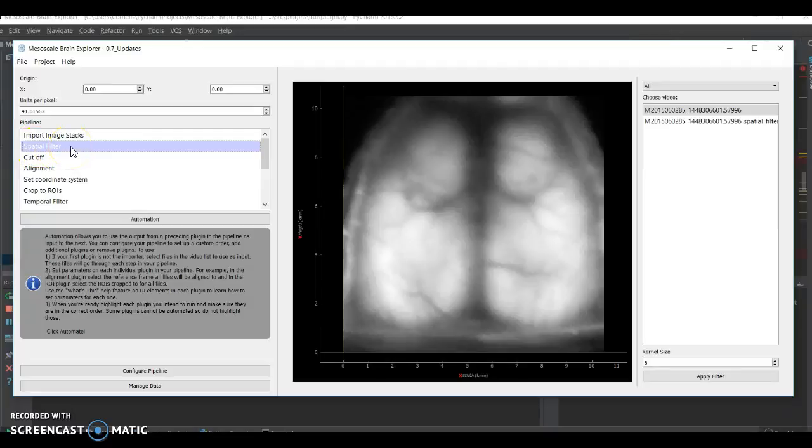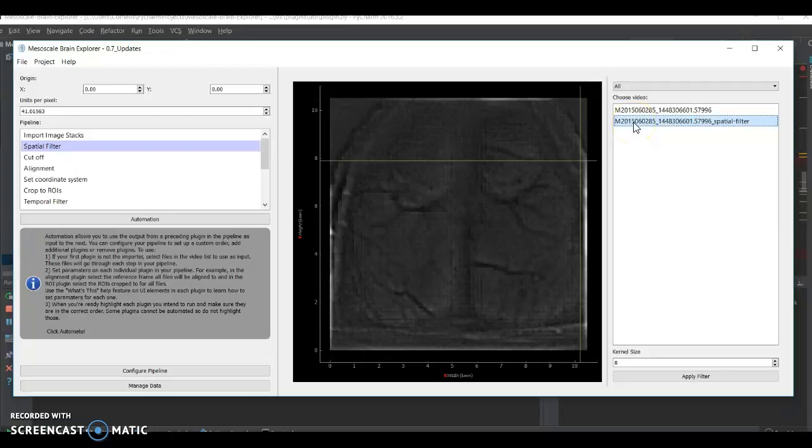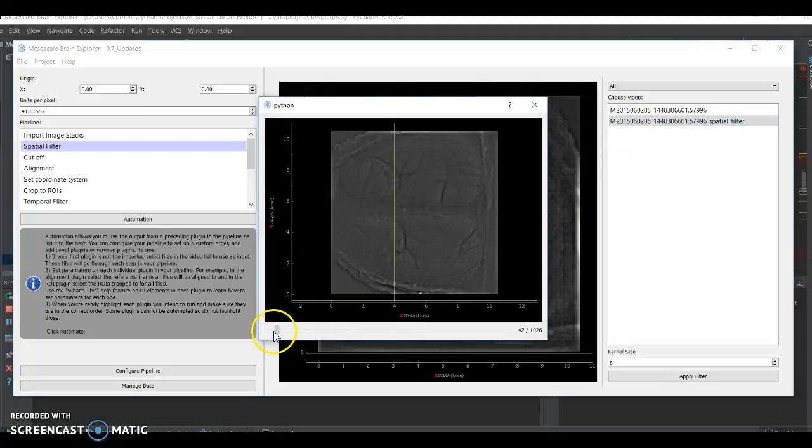Before I start, I would like to point out some mistakes in the previous versions that have now been corrected. In the spatial filter that we had before, I was not correctly subtracting the result from convolving with the kernel from the original data. You're supposed to do that so that you actually properly highlight the blood vessels, as you can see here. So just so you know, that has been corrected.